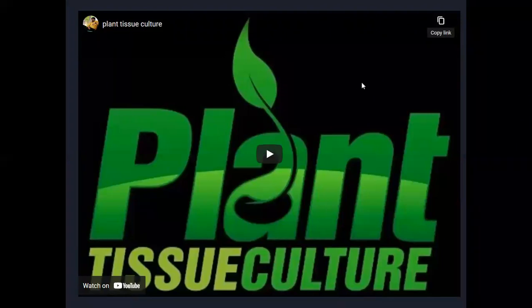Plant tissue culture is the technical procedure for production of plants from explants. Explant means the plant part selected, from root to aerial shoot system.